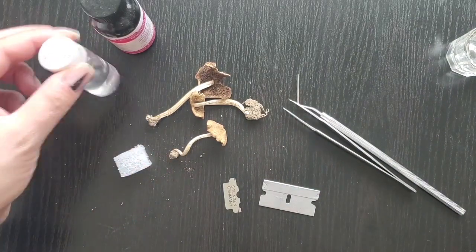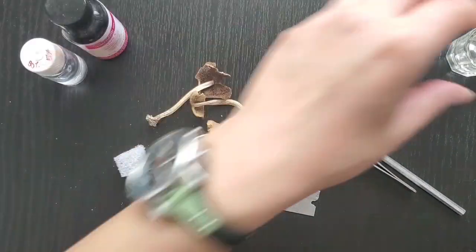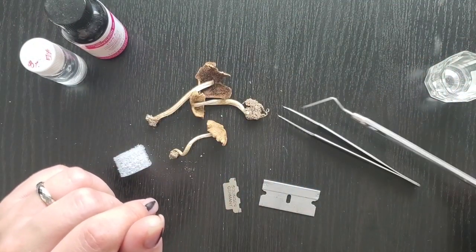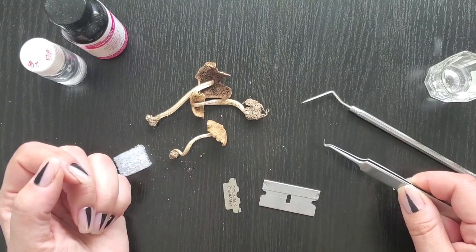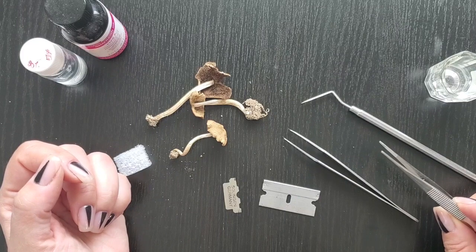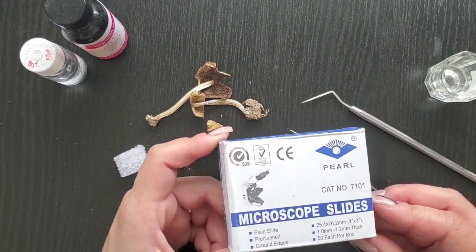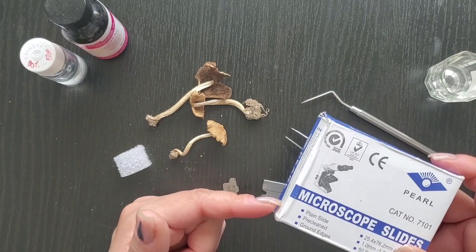So you have the Styrofoam, 80% ethanol. You're going to need oil immersion, something to place the ethanol in to hydrate your sections, and then a needle to guide the sections on the slide, a forceps with a very, very fine tip. I don't recommend using something like this. They're very, very thick. You'll lose your sections on the ridges, and it's just not fine point enough. You'll also need slides for the second method, which is basically using it like a cutting board.